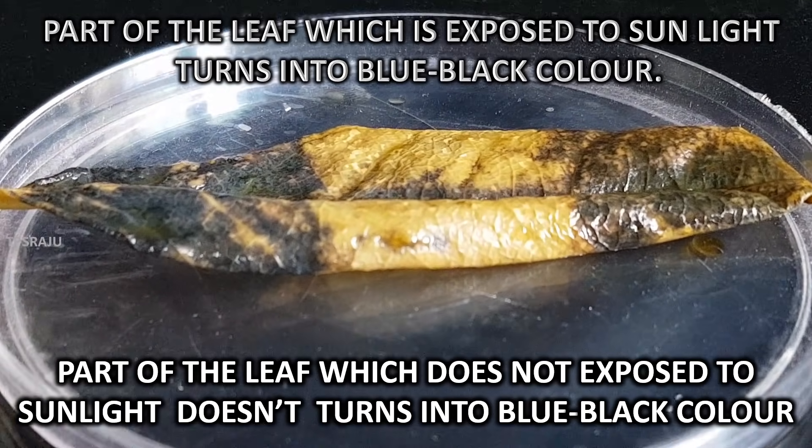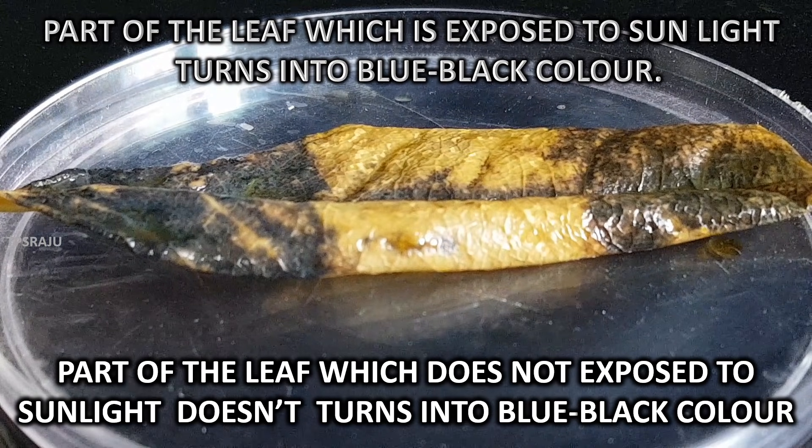The part of the leaf which is exposed to sunlight turns blue-black, indicating that photosynthesis took place in this part. This experiment proves that light is essential for photosynthesis.